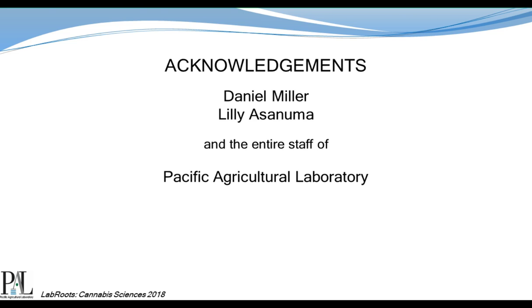How did you identify the list of pesticides beyond the Oregon list? The way we did is we started with the target list that we have developed here for our comprehensive screening in both ag commodities, and then we took a really good look at our hops list. It's the same process we use for all of our matrices. We'll prepare a set of full spikes in matrix, analyze them, and see what works. Based on those results, we can work on the trouble compounds, and it also makes it really easy to evaluate and add new compounds as we move forward.